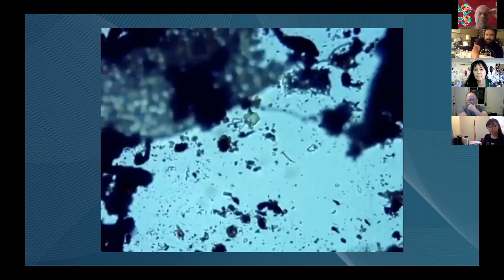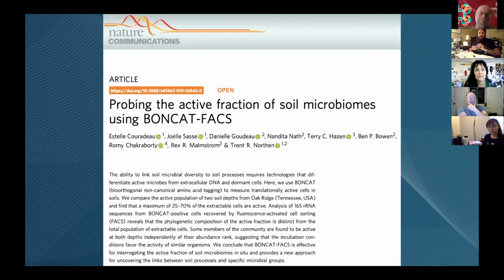But yeah, so, all right, what's a slightly easier way to look at organisms that are alive in the soil? Soil microscopy takes lots of time. We're synthetic biologists, molecular biologists, formally extracting DNA out of the soil. Environmental DNA is great. However, we have no idea whether that fraction of the microbes in your soil are active, dormant, or dead, or maybe it's just extracellular DNA.